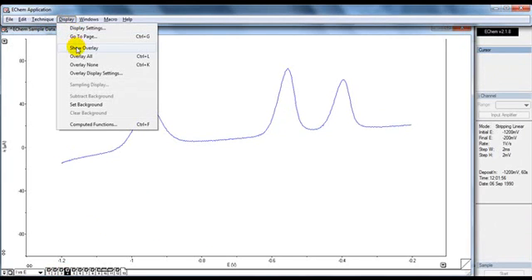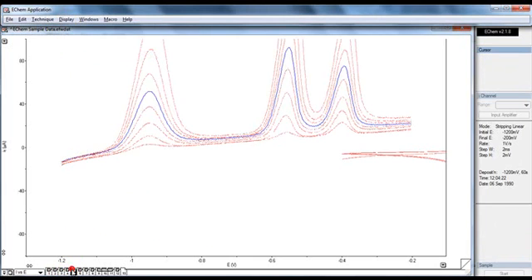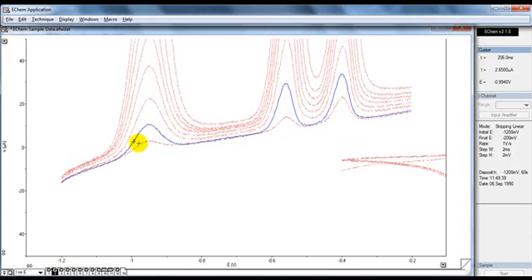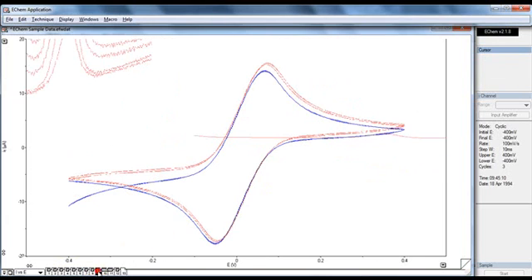in the display menu I can overlay all. So this overlays all of the runs I've done, and the one that's selected down here is in blue. So the ones over here correspond to the cyclovoltammetry that have been done in tabs 9, 10, and 11.